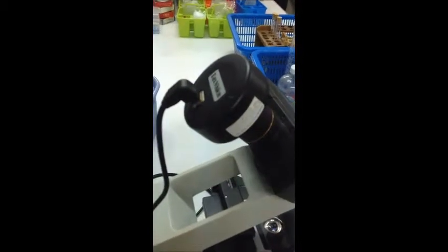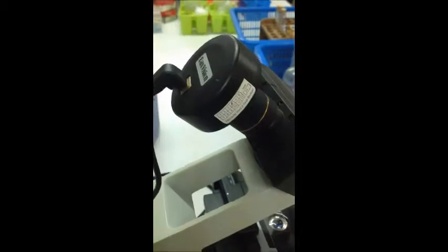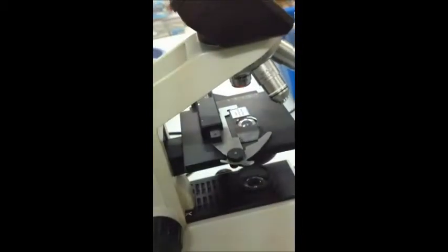most certainly would. The innards of this rather large stand are complex to say the least, and the diagram below shows the basic optical and mechanical internal layout. There are also minor differences among the various models.